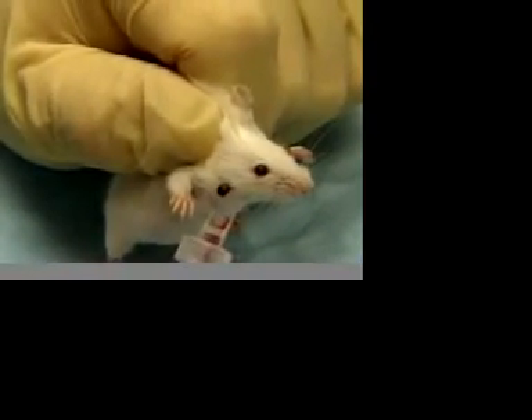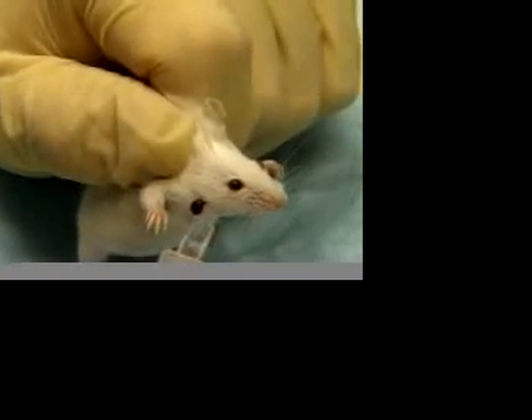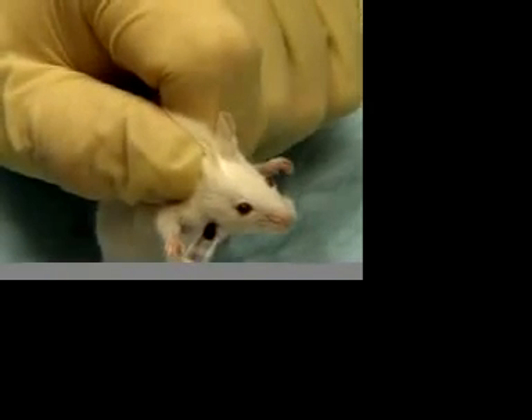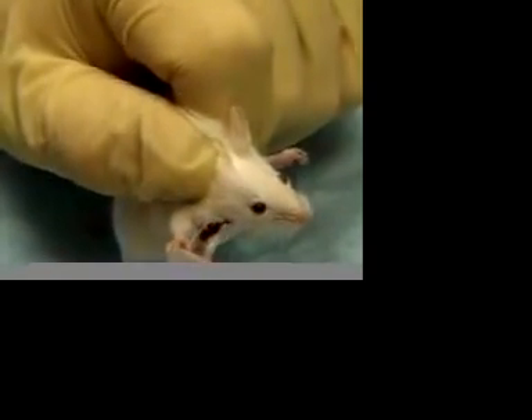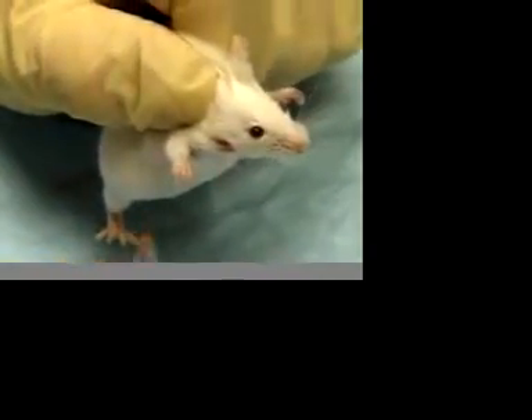Blood flow will start instantly, so have the collection tube nearby. In these demonstrations, we are using a BD microtainer tube which is readily available from Fisher Scientific and can be purchased plain or with separation gel or anticoagulant. For your convenience, there is a link to Fisher Scientific's microtainer webpage next to this video on our website.